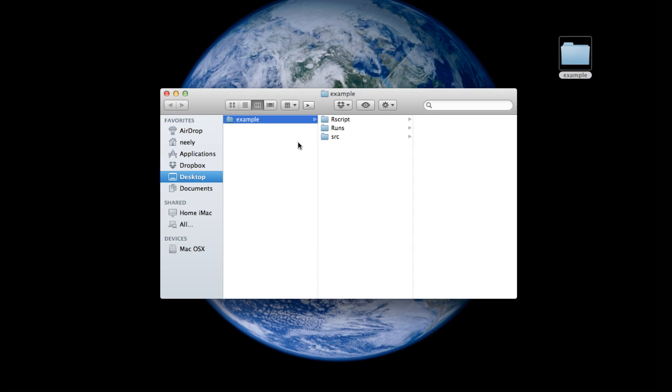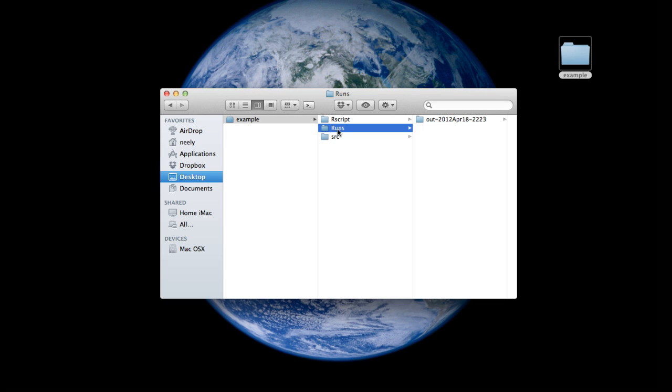In that folder, I've made three subfolders: one called rscript, one called runs, and one called source.